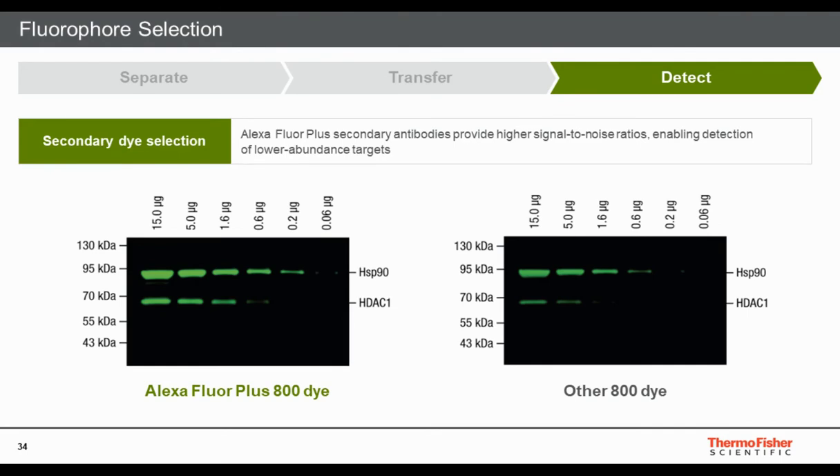Different dyes have significantly different intensities — much like ECL substrates ranging from standard to Femto sensitivity. How the dye is conjugated and the dye-to-antibody ratio matter: too little dye gives weak signal, too much causes quenching. Comparing an Alexa Fluor Plus 800 secondary with another 800 dye secondary at a similar conjugation level, the Alexa Fluor Plus 800 showed sensitivity down to 0.06 µg of lysate for both HSP90 and HDAC, whereas the other 800 dye lost significant sensitivity — likely being less bright and more prone to oxidation.